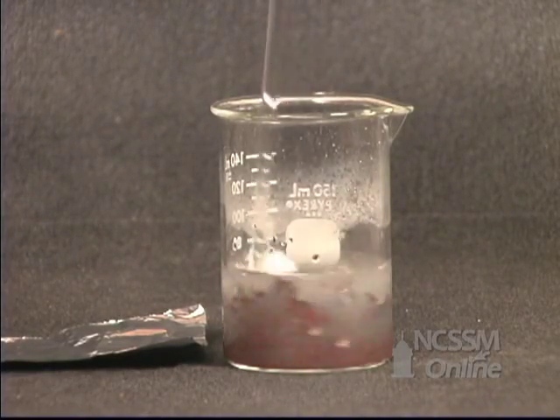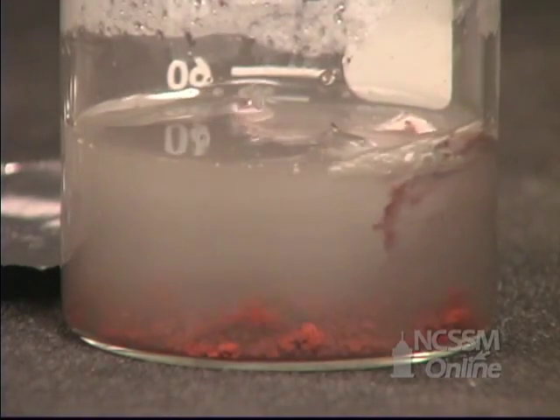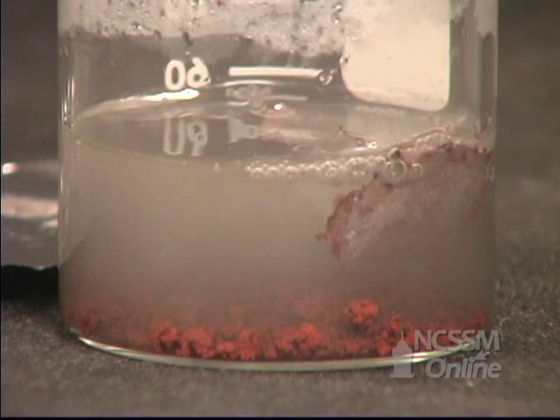After 10 minutes, a colorless solution remains. A reddish brown solid sits at the bottom of the beaker. There's excess aluminum foil in the beaker.